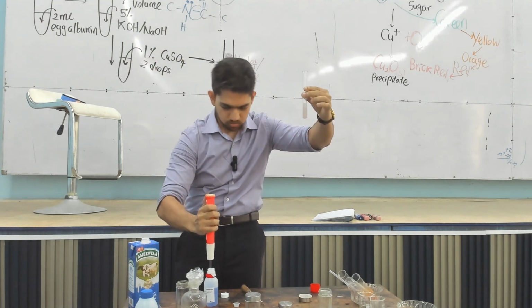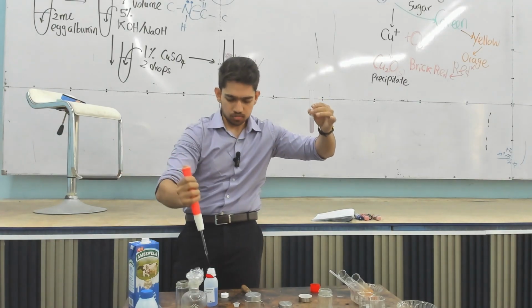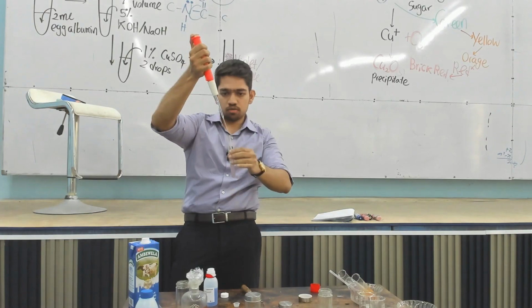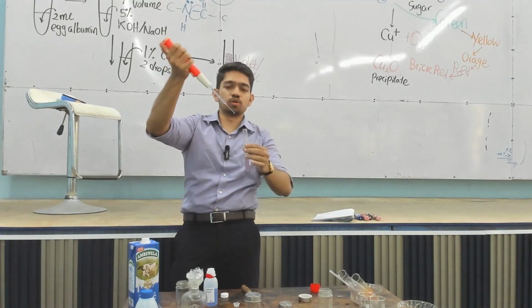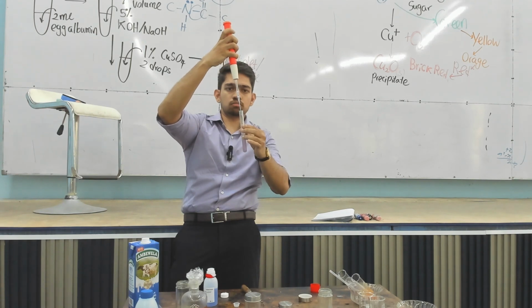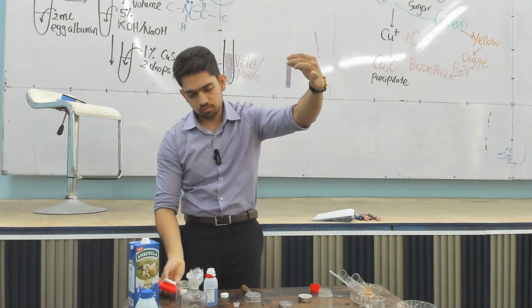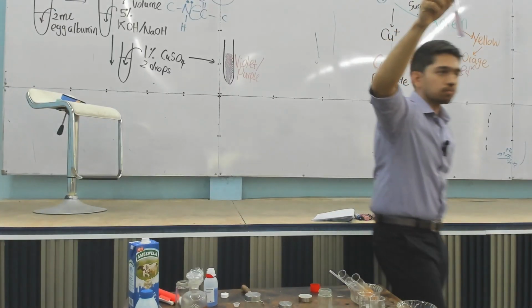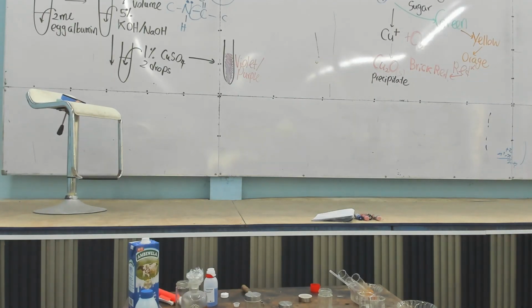Online people, you can see it's white colored. Previously there was a purple color. I can use a normal test tube because I'm not heating it. Can you see at the back? This is just fat-free milk, so you do have some protein. You can pass this around.